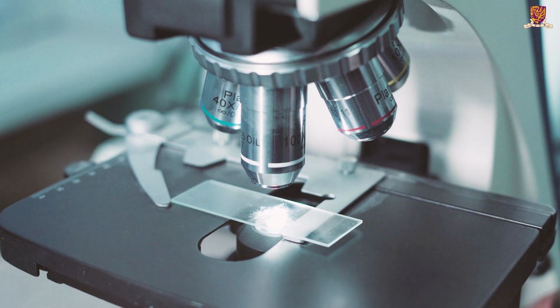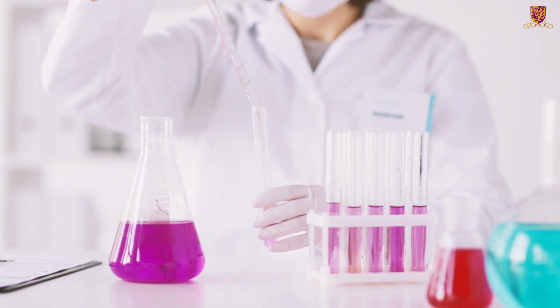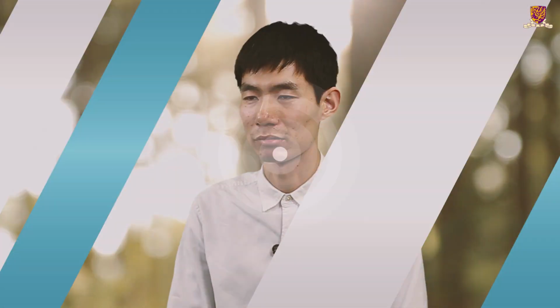Lab works on developing novel optical microscopy techniques for various imaging applications. The work in our lab is very comprehensive. That involves understanding how light interacts with objects, building novel imaging instruments, performing image reconstruction, and post-processing. We work with material scientists, biologists, and doctors to promote our imaging techniques. Let me show you the optical microscopes in our lab.